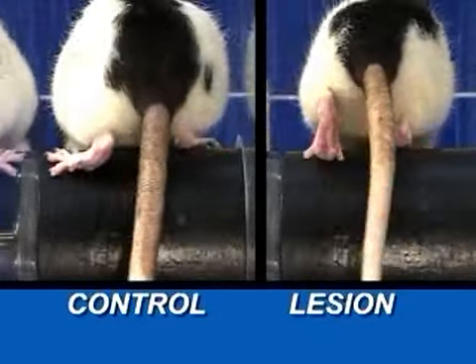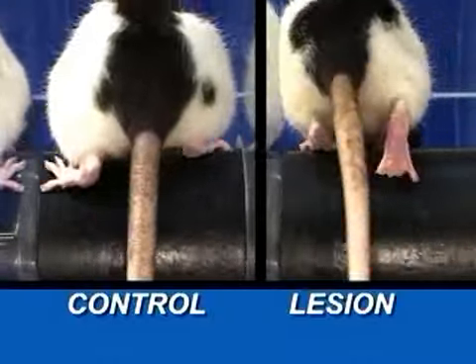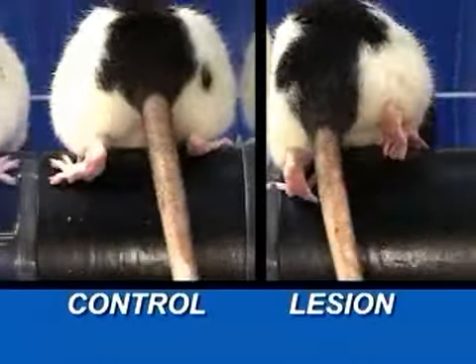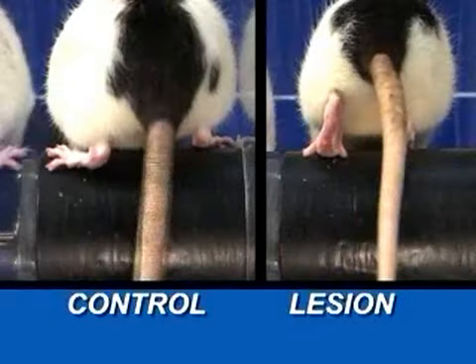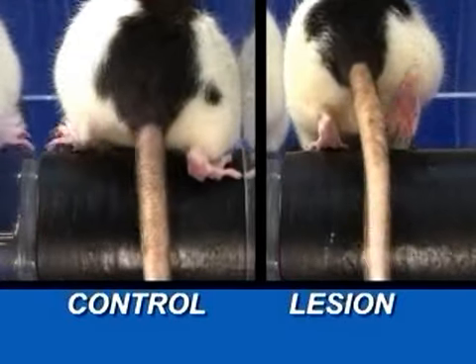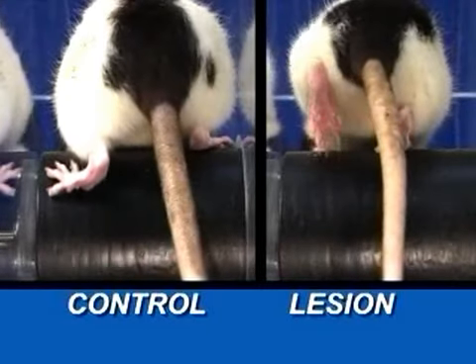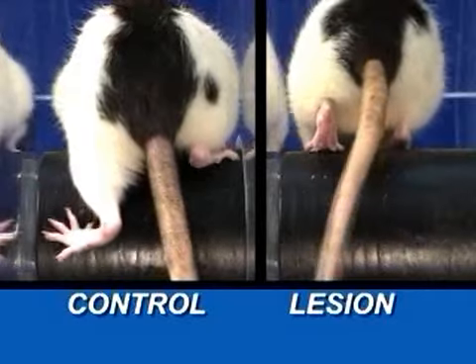The control animal places its hind paws with the toes just outside the midline axis of the body. As the paw reaches the end of the stride, the paw pivots outward as the animal pushes off the drum surface. Note that the 6-OHDA animal's paws are placed directly parallel with the midline axis of the body and do not pivot at the end of the stride.